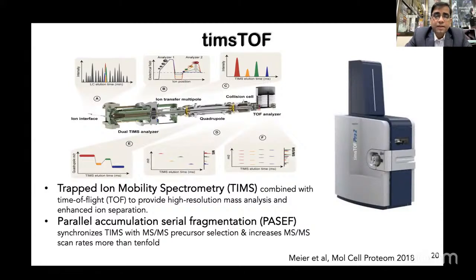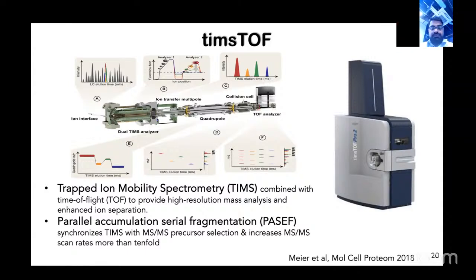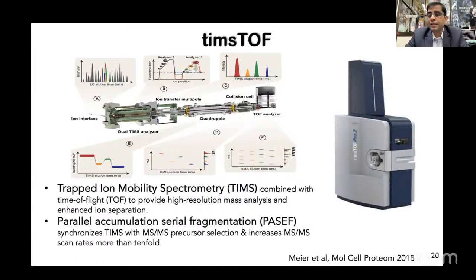This is one of the technologies which we are very pleased to have, with the first setup of this in our startup company here, Proteomica International Private Limited. Dr. Arghya Banerjee is live there. He's going to show you the timsTOF mass spec, another mass spec configuration. You have seen a couple of Orbitraps; now you can see the timsTOF and appreciate the latest revolution in this area. So, Arghya, please show the live session from your side.